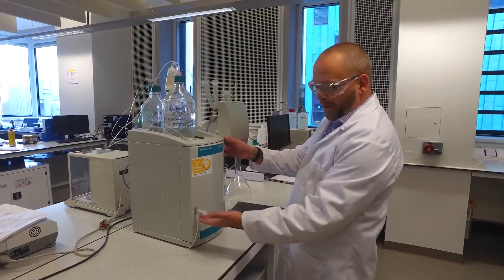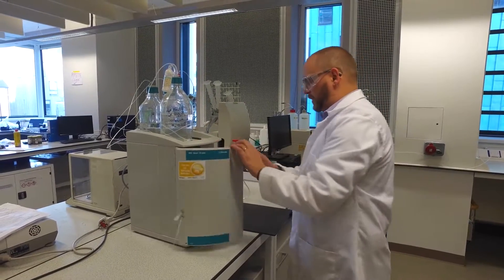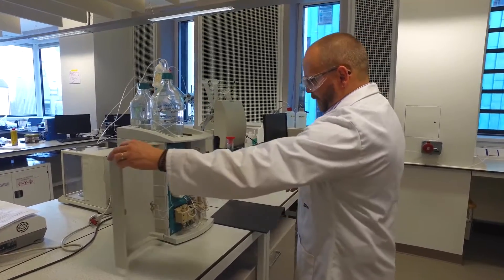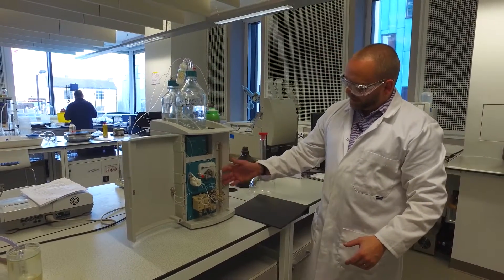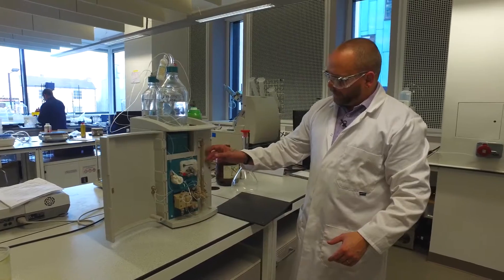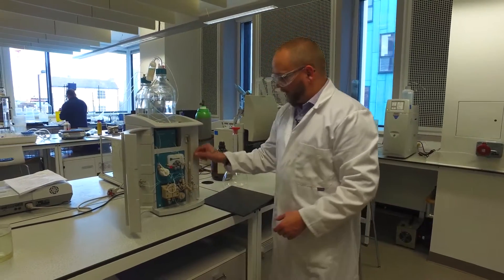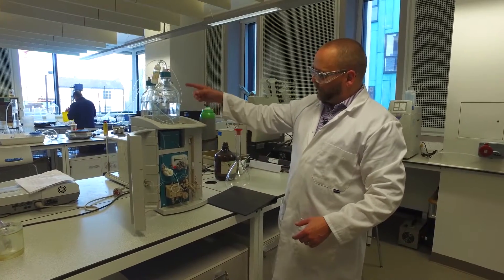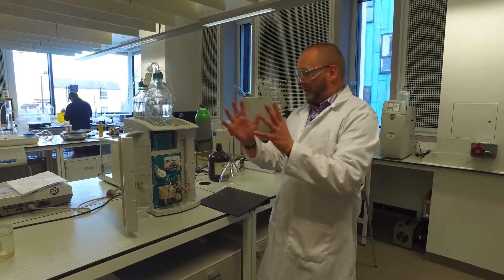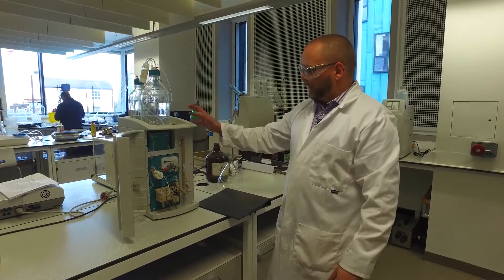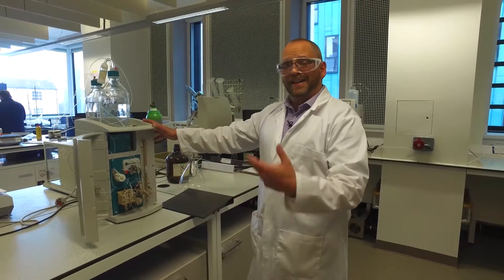You'll see on the front here where you would introduce a sample. This would be your eluent at the top. As you flow your sample through, in here is an ion exchange column. Depending on how your material interacts with this column as your eluent flows through, you'll get a separation of those particular compounds. This will give you an idea of the type of compound that's present and the amount.